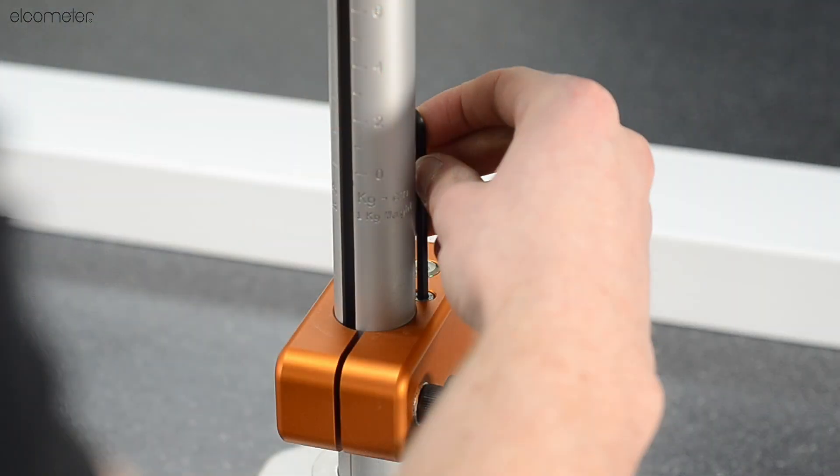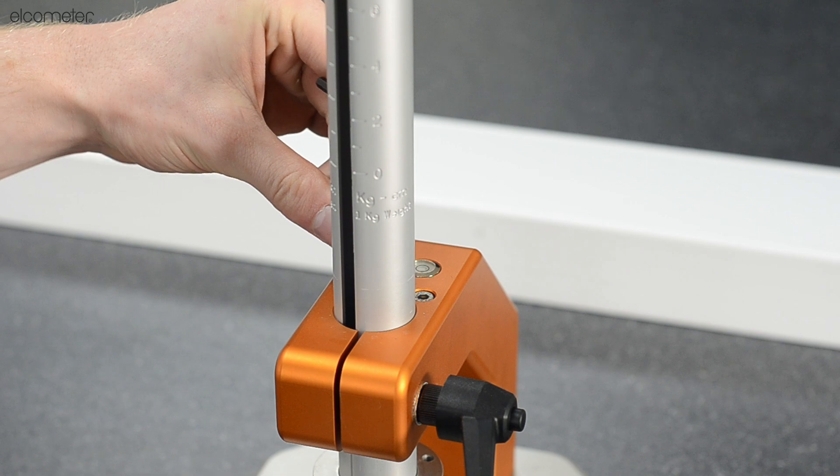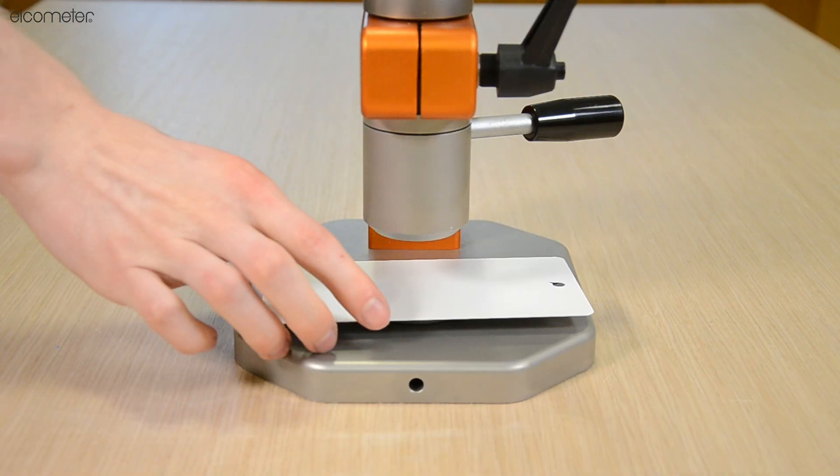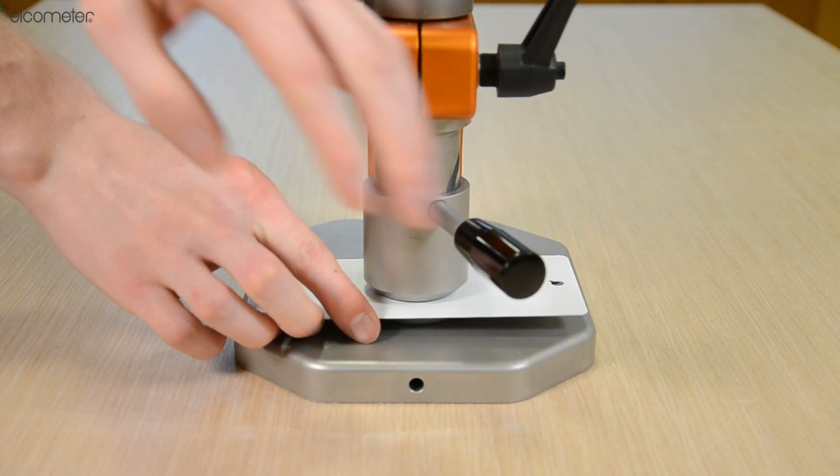Secure your clamp by tightening the included screws using the included hexagonal wrench. Place your sample onto the die and secure it into place by lowering the clamp.